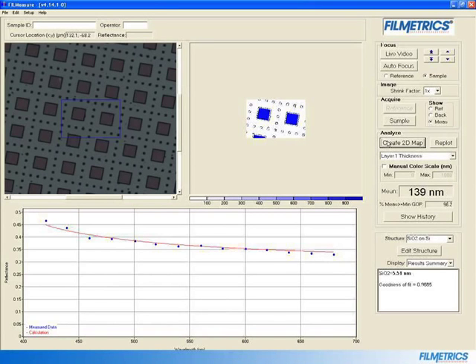We can see that the 2D thickness map rendered an image of the patterned area, with areas that have no SiO2 deposited on it showing up as white.